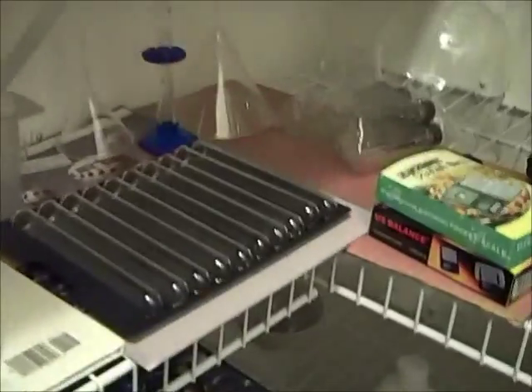And here's a collection of test tubes made from heat-resistant glass. And here's a round-bottom flask of 1000 milliliter size. This glassware cost me a total of around $70 in total.